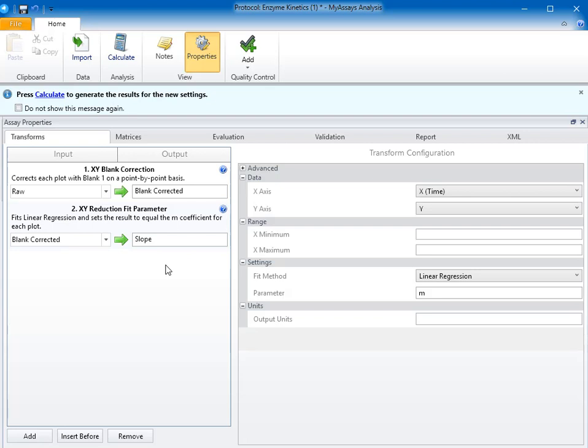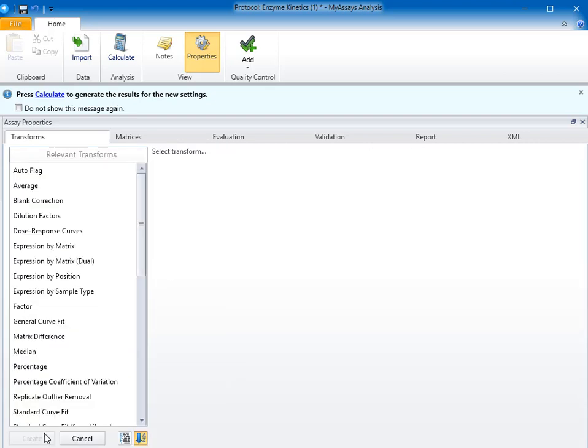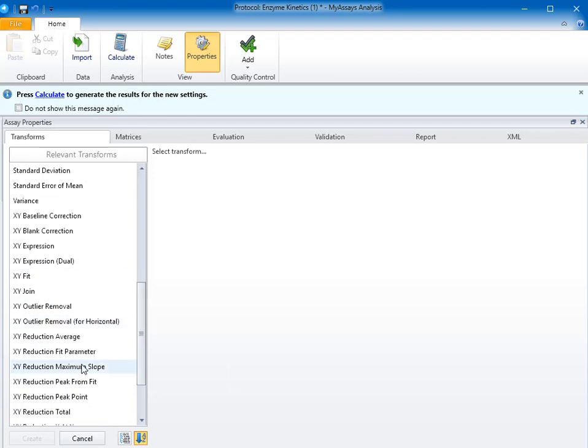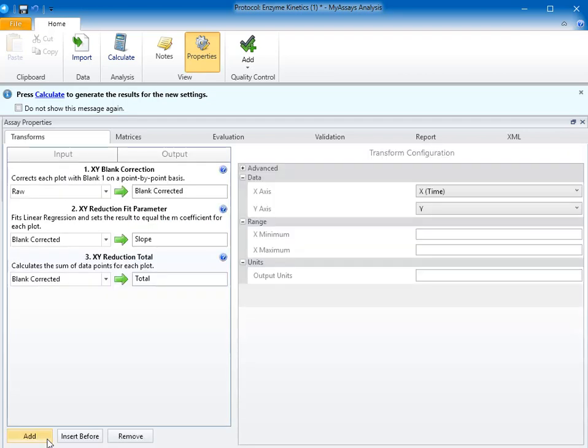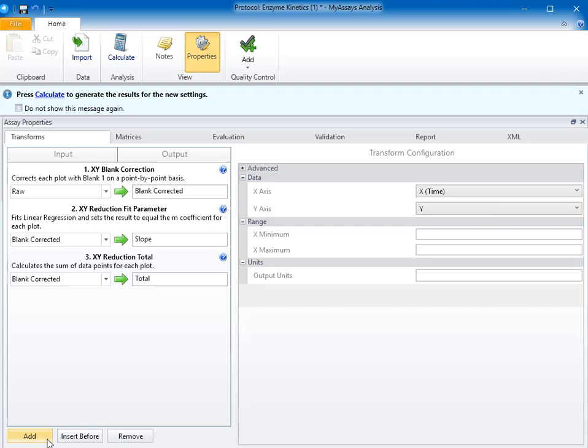Next, to calculate the total of the data points, I'll add the XY reduction total transform. This transform will calculate the sum of the data points for each plot.